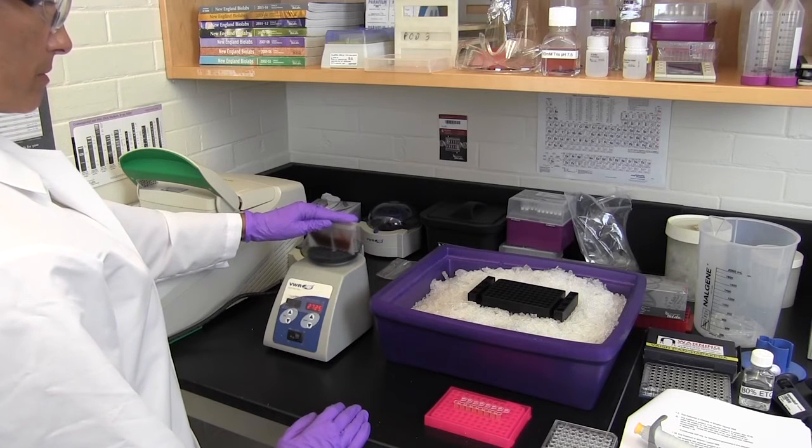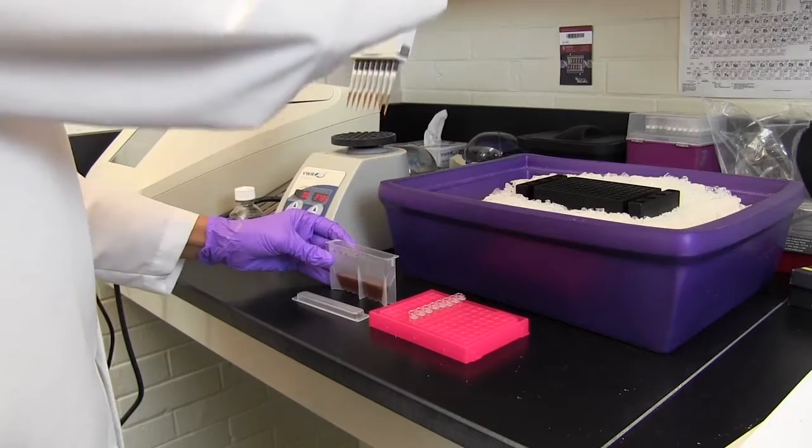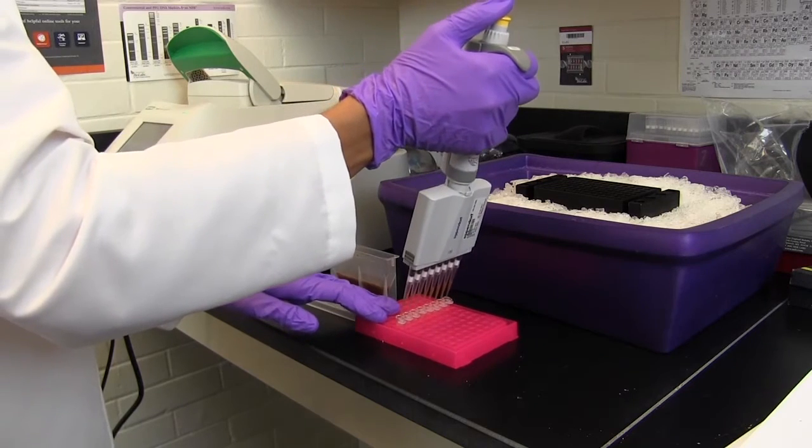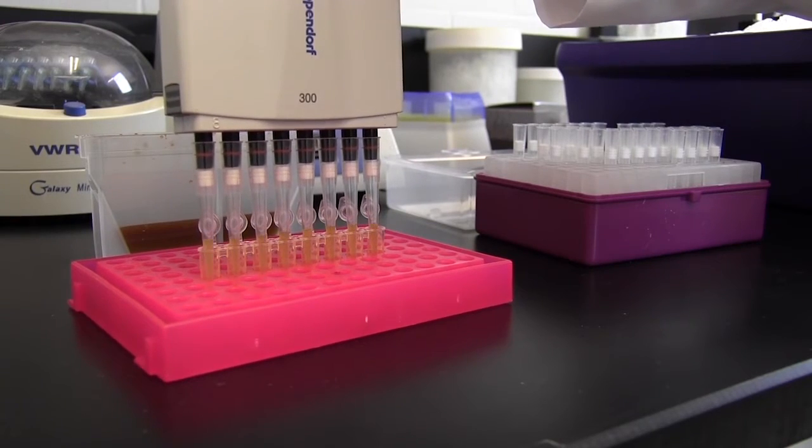Magnetic beads should be used at room temperature and should be vortexed before use. For the first round of size selection, add vortexed beads to the reaction and mix well by pipetting up and down at least 10 times.